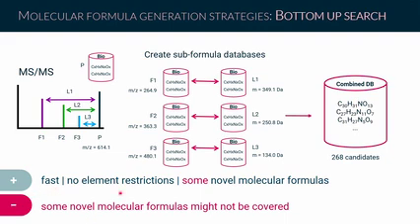So this is also fast. You don't have to care about elements, and you get at least some novel molecular formulas. And the downside is that some molecular formulas might not be covered.